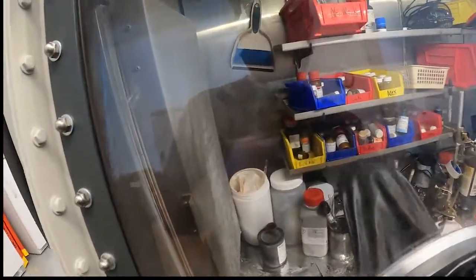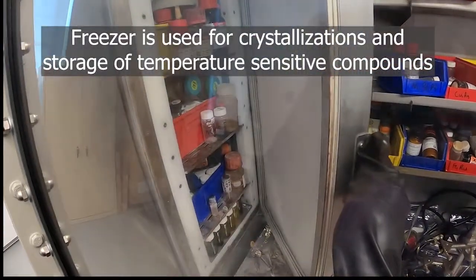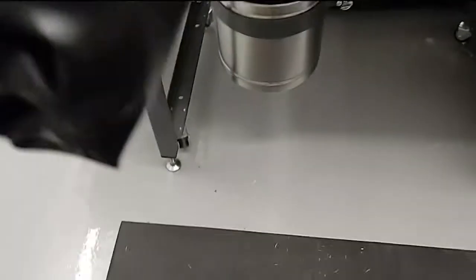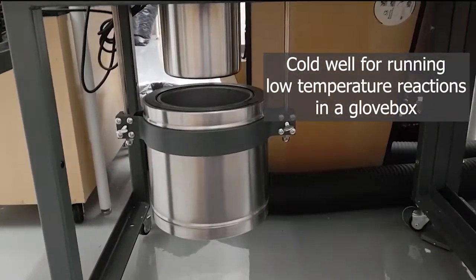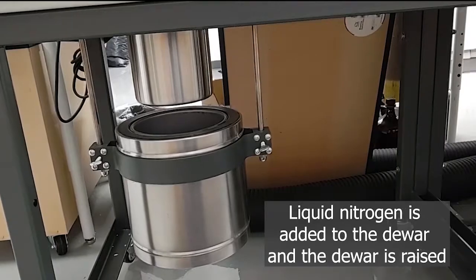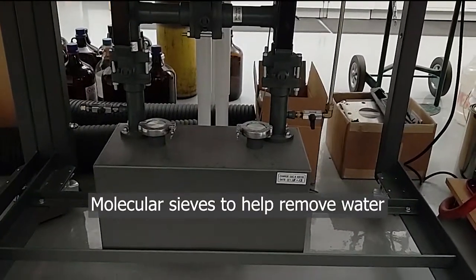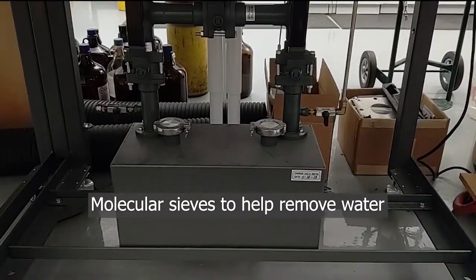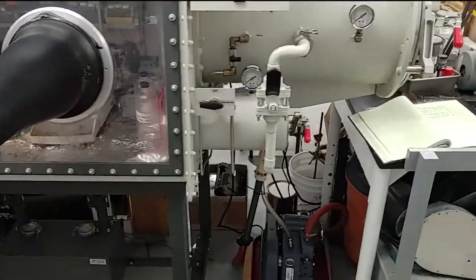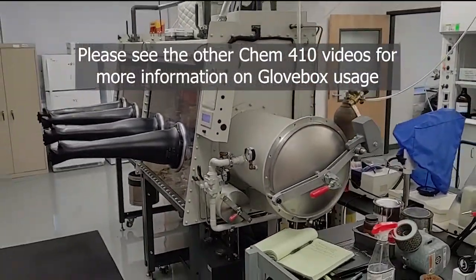Getting my arm into this glove to show you the inside of the freezer — as you can see there's our little freezer. Just kind of a general overview of the larger glove box, currently being used in a research setting.